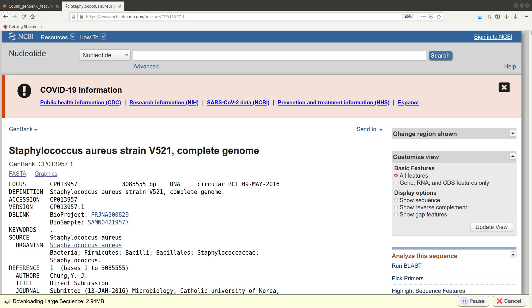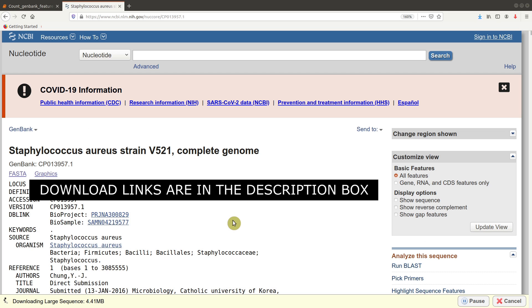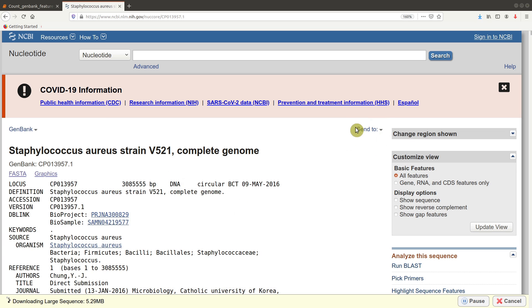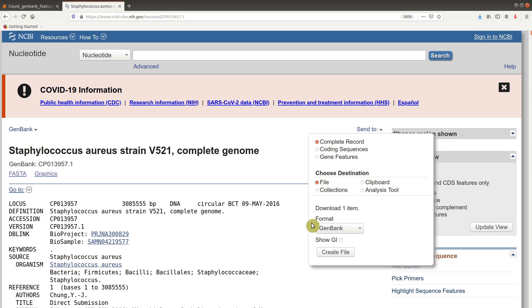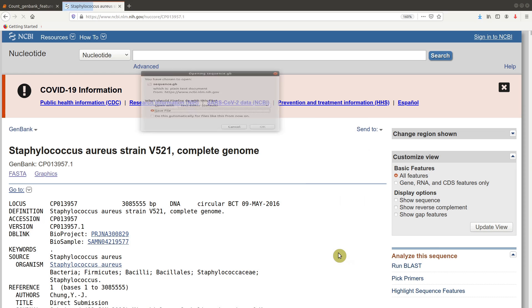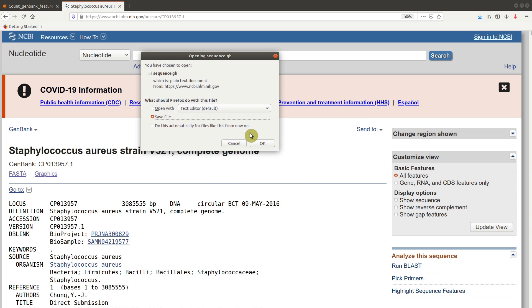This is the download page for one of the genomes we are going to use — Staph Aureus strain VIN 521. In order to download the GenBank files, we will go to this section here: Send To. Then we check Complete Record. Then when you come to Choose Destination, you check File. When we come to the Format, we select GenBank. Then we click on the Create File button. You will then be asked to download, so I will save the file.